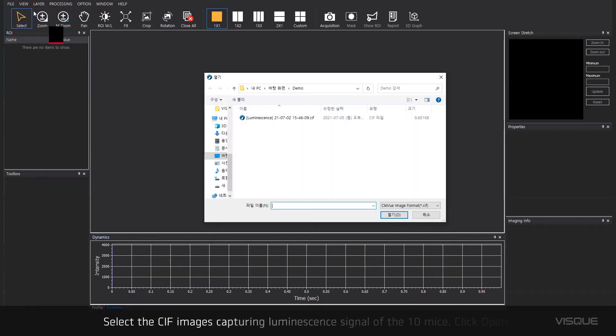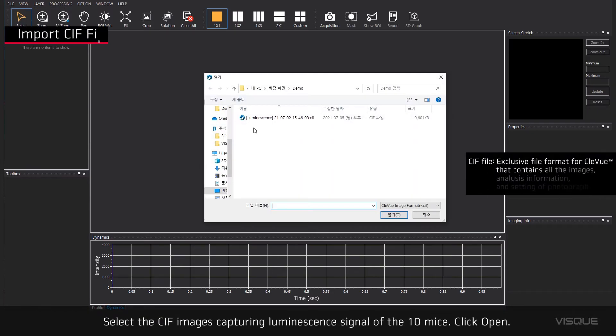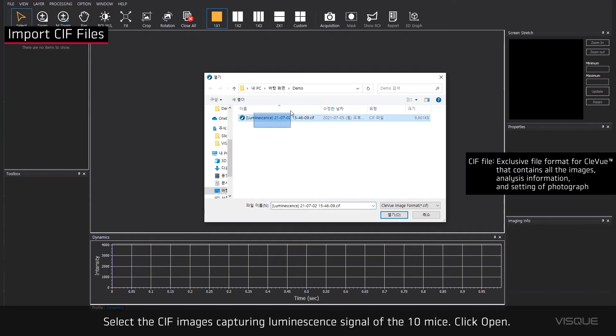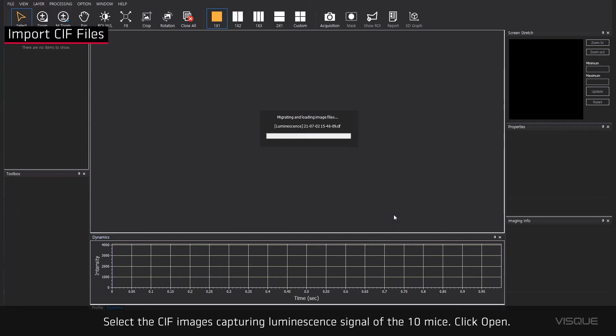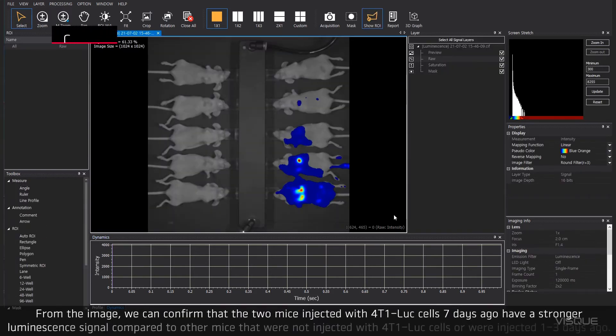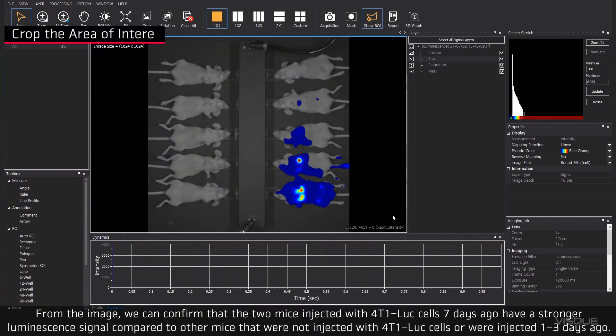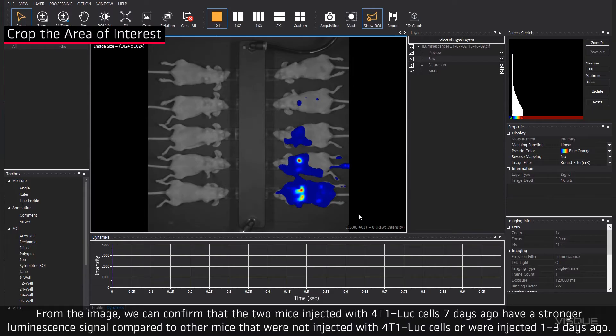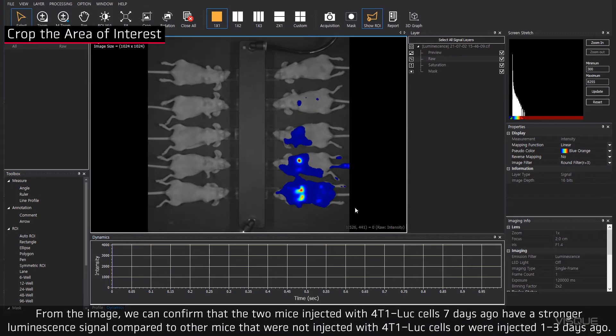Select the CIF image capturing luminescent signal of 10 mice. Click Open. From the image, we can confirm that the two mice injected with 4T1-Luc cells 7 days ago have a stronger luminescent signal compared to other mice that were not injected with 4T1-Luc cells or were injected 1 to 3 days ago.